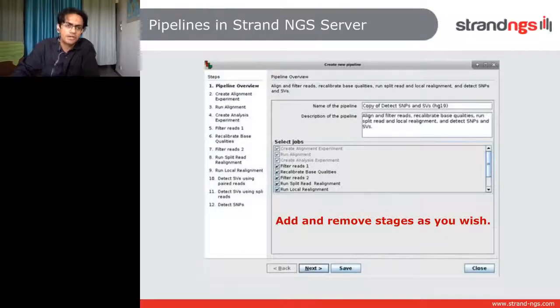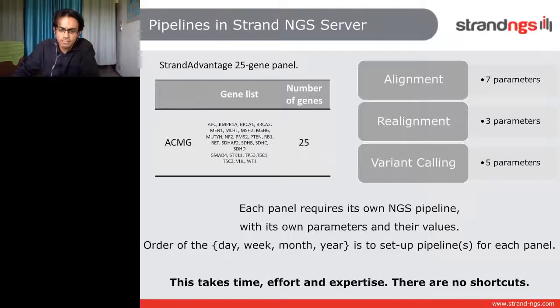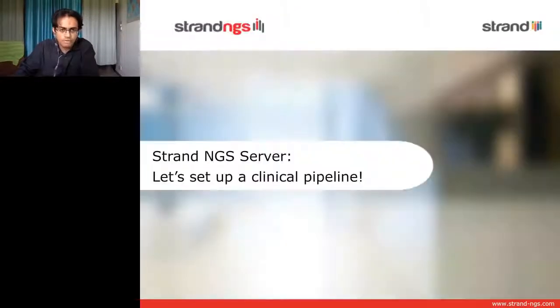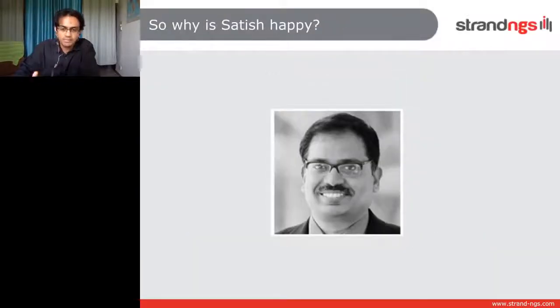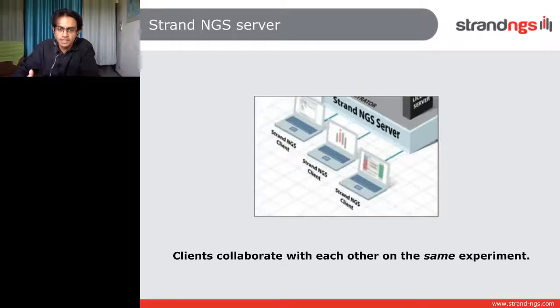And depending on the number of compute nodes available to you, you can have several experiments that are running in the background, and those experiments can go on for as long as they want to, but at the same time, each client is viewing either an experiment that's already done or they're viewing something else. So that's exactly the whole point of Strand NGS Server, is to separate computation from visualization and to separate either of those things from storage. And that's what Strand NGS Server enables.